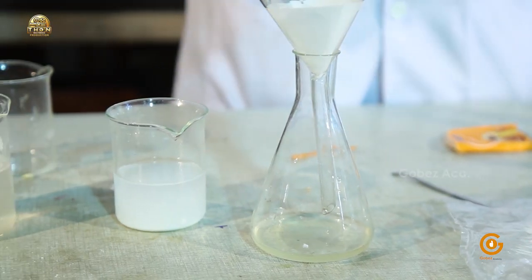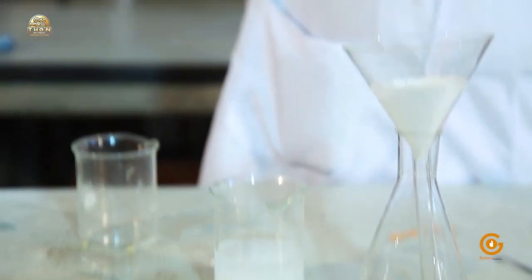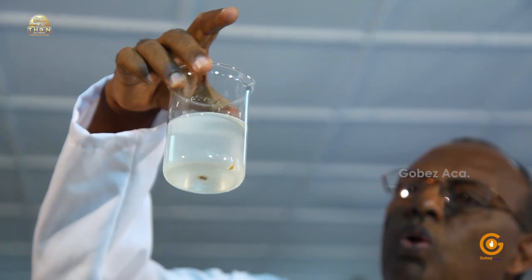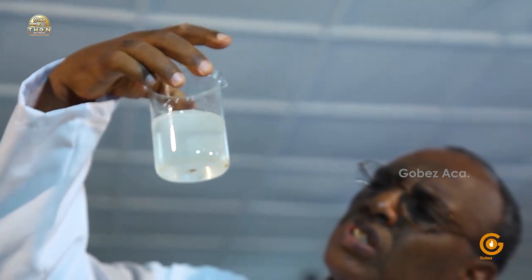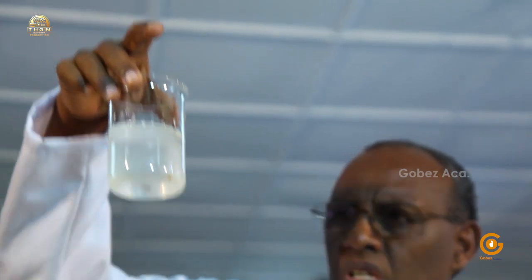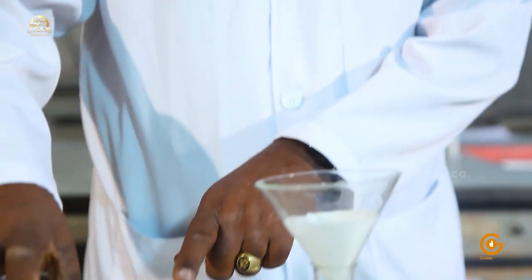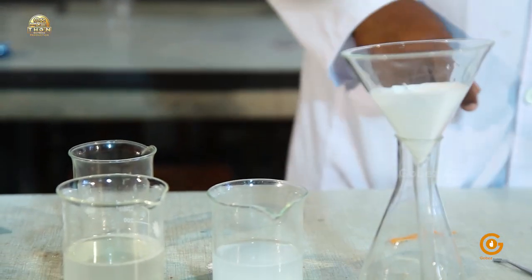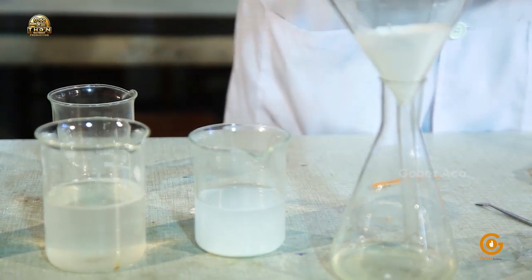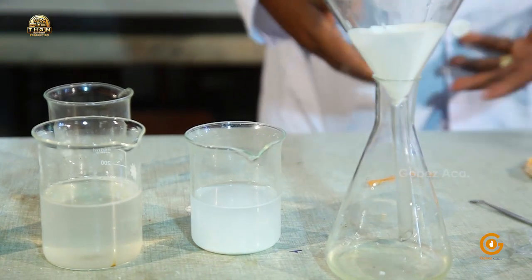We could do the same thing with this one, but this is with sodium chloride. It seems clearer, even though there is some cloudiness like this one. It's not as severe as this one. So by filtering, we can see if really everything has dissolved or not.